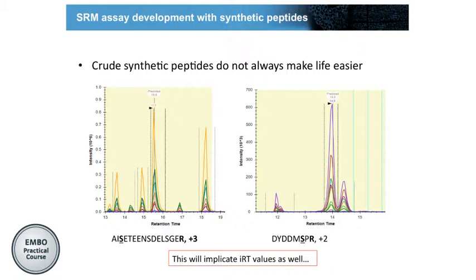throughout the synthesis. In the moment when they come off the column, they get ionized, they get this energy, they lose this protection group, and in that moment, it's exactly the same molecule. They are all exactly the same molecule, and this is why they all look exactly the same in terms of relative transition intensities. The first example, I think, is most likely this example. You see all these groups, all exactly the same intensity, so in the mass spectrometer you always have exactly the same molecule, but when they were on the LC, they were somehow different.